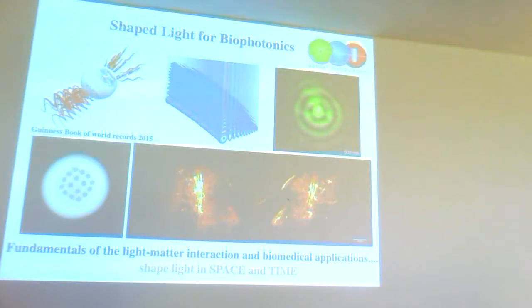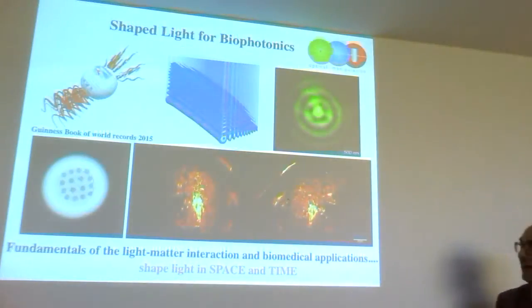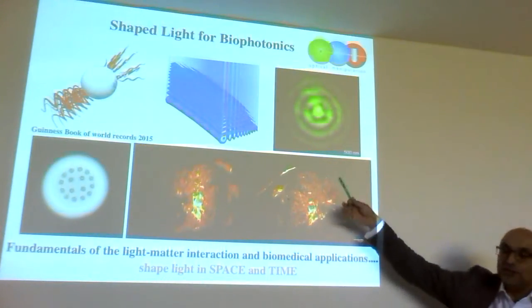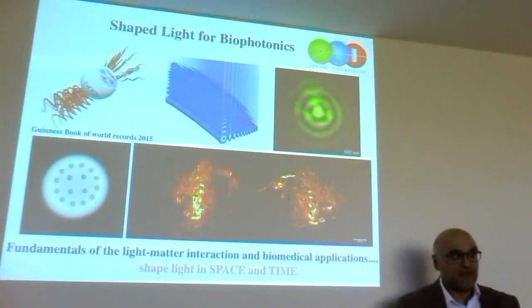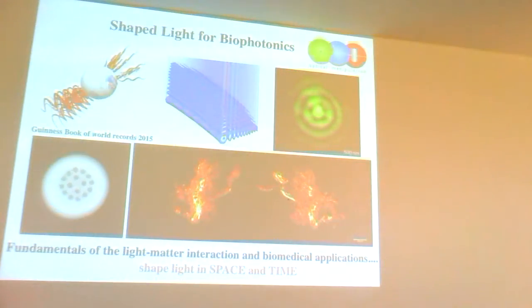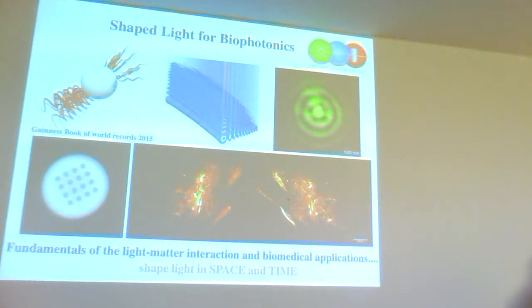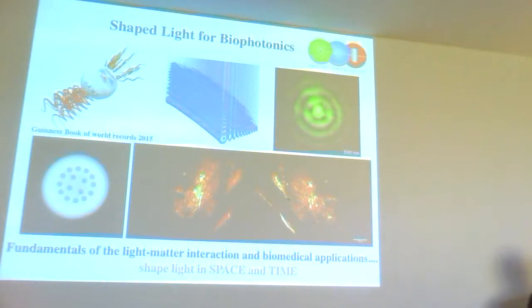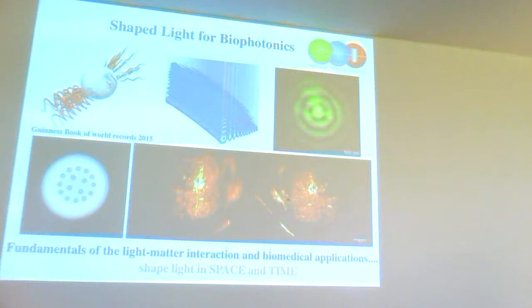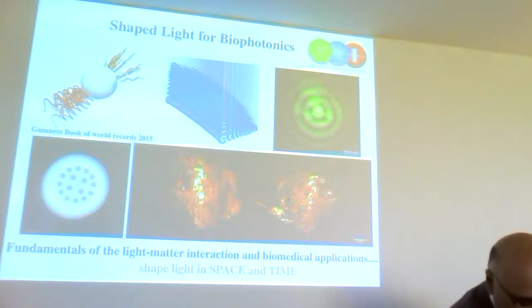The reason you might want to use that is that a multimode fiber is 1/10 of the diameter of an equivalent fiber bundle that you might use for endoscopy, and therefore 1/100 of the area. And this is an example of light sheet imaging using beam shaping. This is a zebrafish brain with membrane-stained RFP, and you can see the structure we're getting compared to what one normally might get. Light sheet microscopy is currently a very hot area. I've stumbled into it, but it's very powerful, and I'll come on to that. The main thing to take away is that it's simply shaping light in space and time.